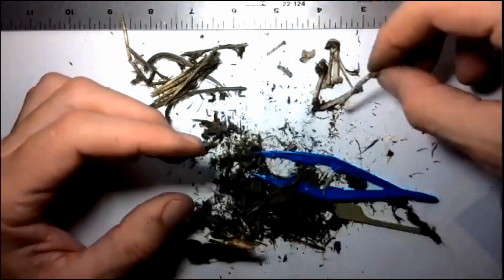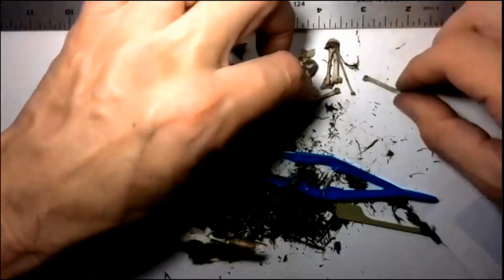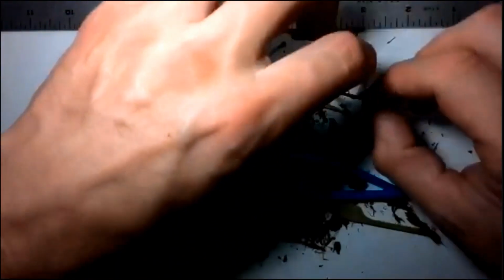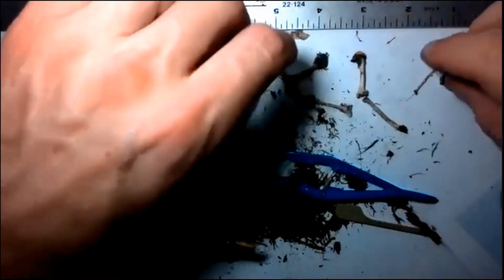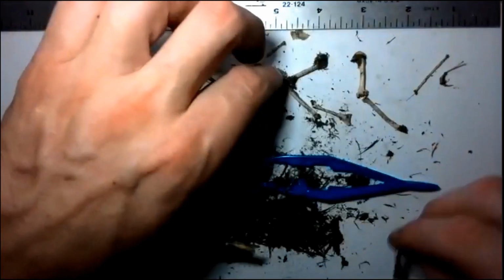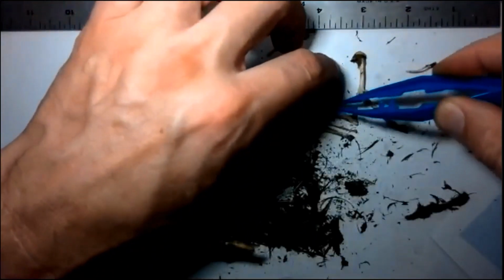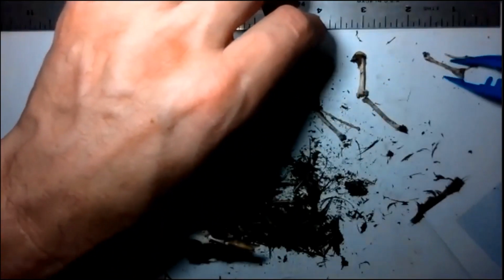We found here another, this is the other leg. So you can see if I put it together. Let's be a little organized here with our skeleton. This one is here. So we have the entire leg there. Two legs.